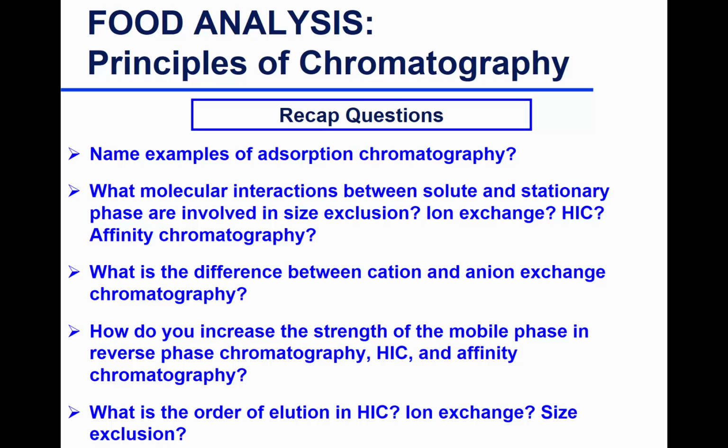You make it more nonpolar, because in reverse phase your stationary phase is nonpolar and your mobile phase starts off more polar. And then if you want to attract those nonpolar molecules that are interacting with your stationary phase, you increase the organic phase percentage in your mobile phase.